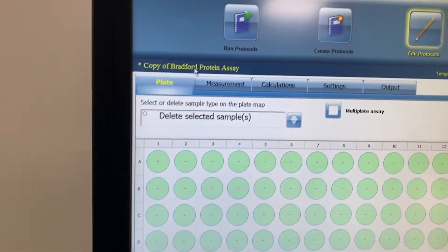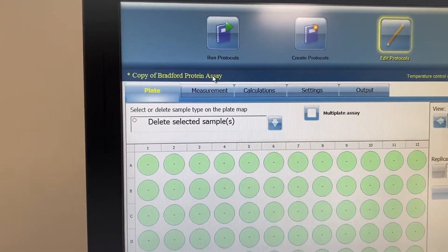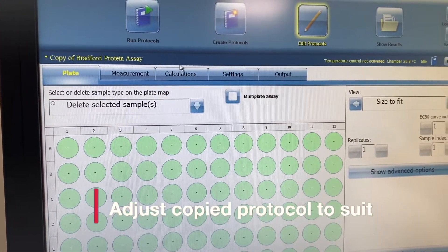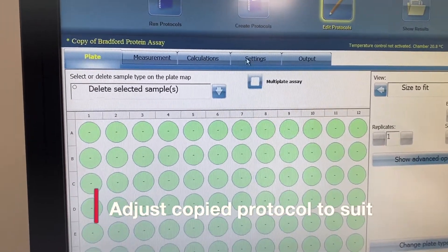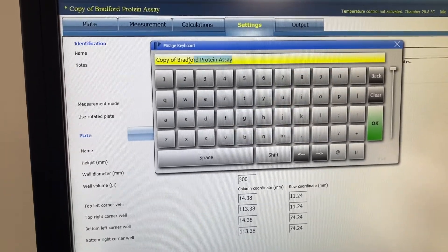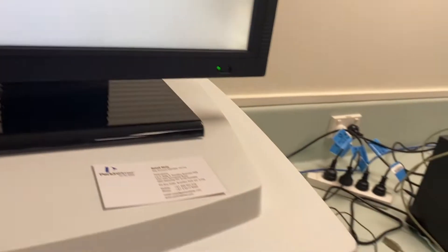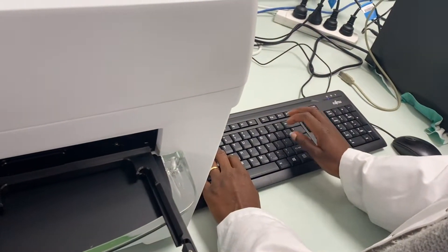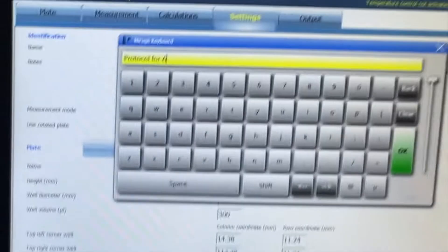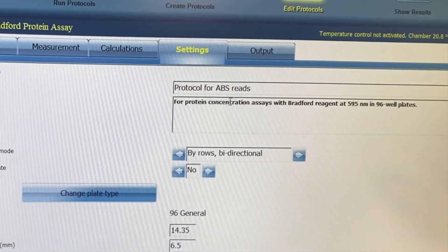Now you've got a copy, but it's probably not going to be for a Bradford assay — it's going to be an absorbance read for some other assay. So then you can change the name. If you come into the settings, you get a pop-up screen keyboard where you can name it whatever you want. You can use the physical keyboard or the on-screen one — for example, 'Protocol for Abs Reads' — and go okay, and now it's named.